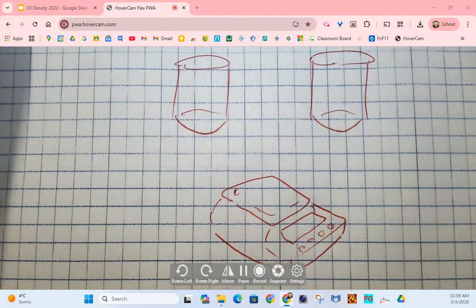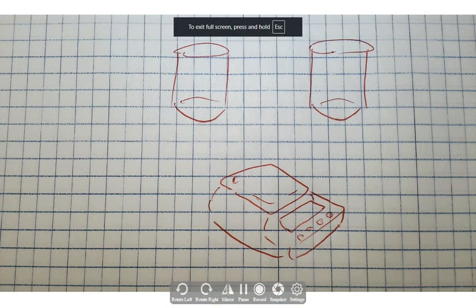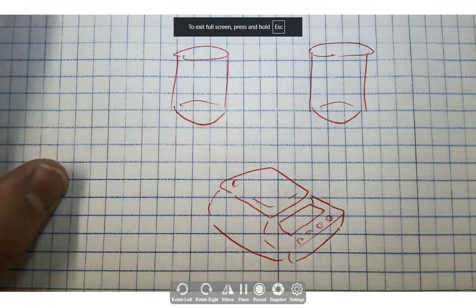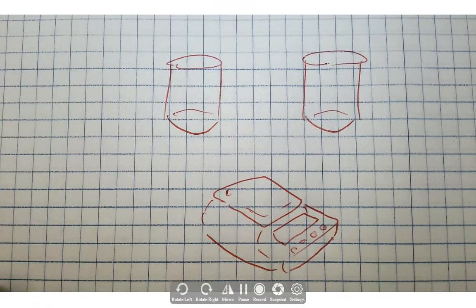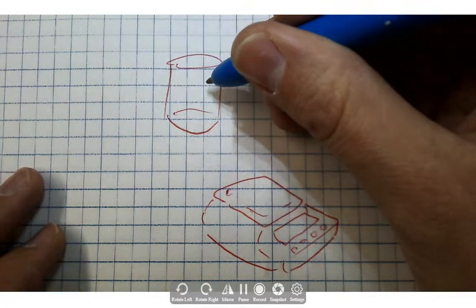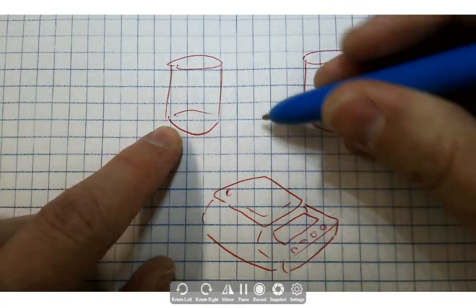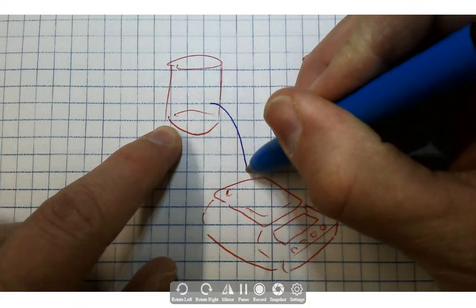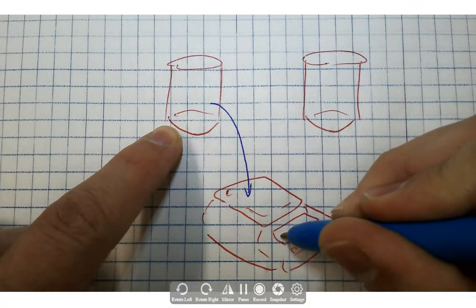I want to make sure that there's no doubt about this. I want everybody to be clear about how to deal with these kinds of numbers, because we're going to have a lab that comes up. If you have a substance and you're trying to figure out how much mass a liquid material is, you could take that liquid material, set it aside for a minute, but if you take an empty vessel like a beaker, you can put it onto an electronic balance and find out what its mass is.